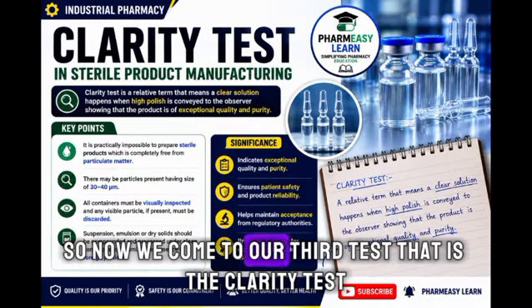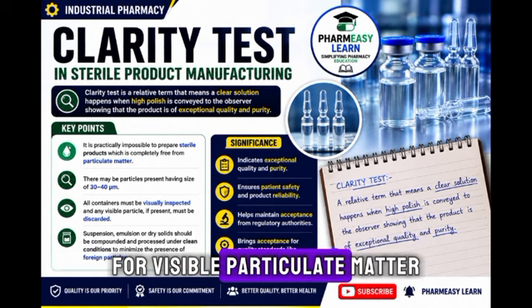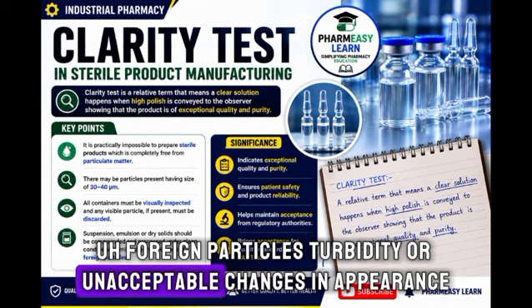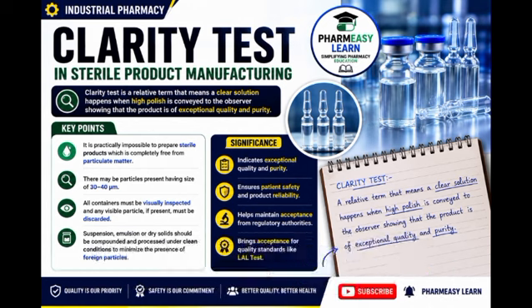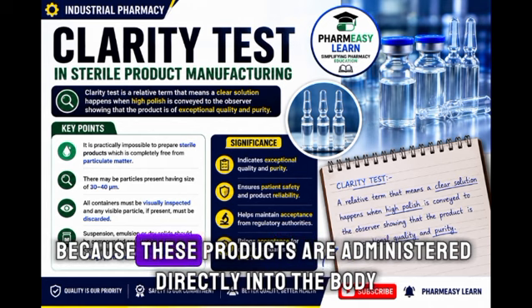So now we come to our third test, that is the clarity test. The clarity test is used to examine a pharmaceutical preparation for visible particulate matter, foreign particles, turbidity, or unacceptable changes in appearance. Clarity is especially important for injectable preparations because these products are administered directly into the body.